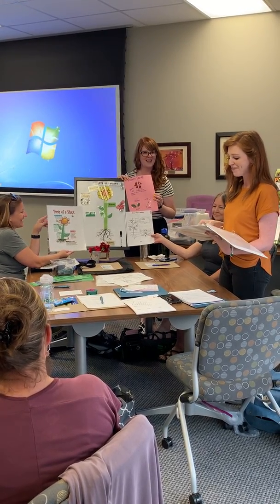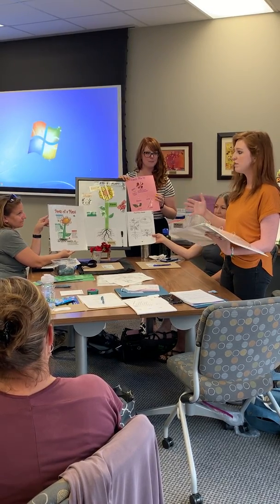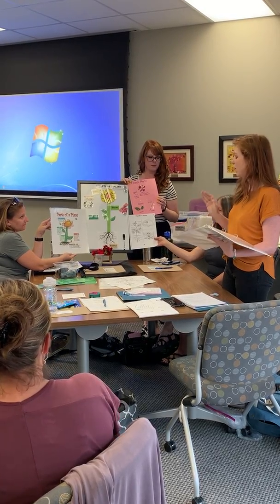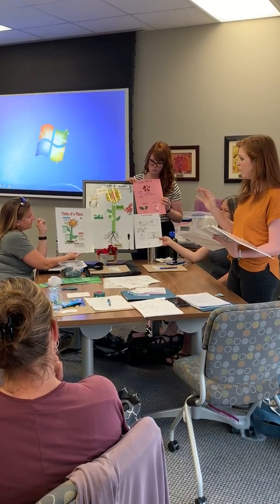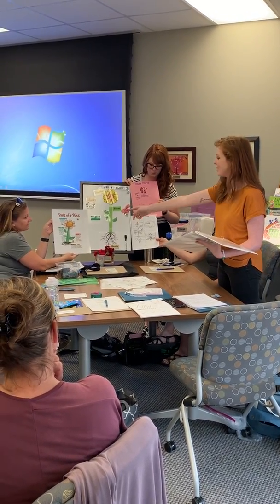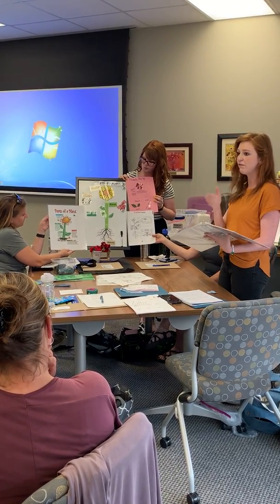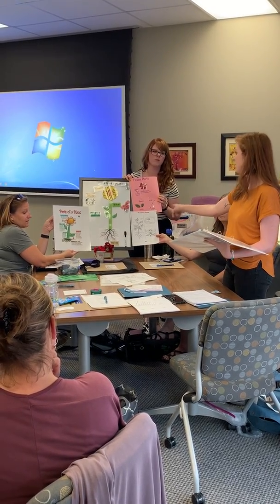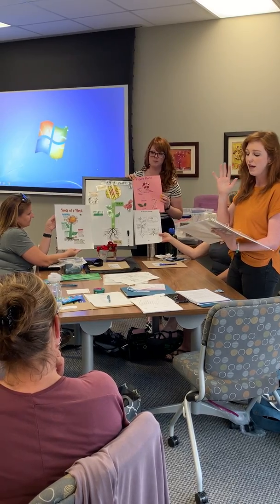were the ones that pulled it apart while the rest of us talked about it and what we thought each word meant and where we thought it should fit. And so we started with taking off the sepal, and none of us really were sure what that was. So we had this really great diagram, both of them here, to reference. If we didn't know what it was, it was really easy to figure it out because someone was able to look at the diagram and say, oh, it's this part right here, and we could compare it to our flower.